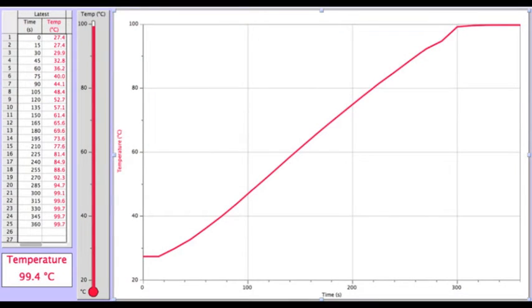Let's get a better look at the graph. Here we can see the temperature was increasing at a mostly steady rate until around 300 seconds. Then the temperature plateaued at right around 100 degrees Celsius — that is the boiling point of the water.